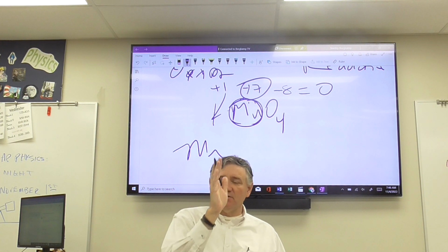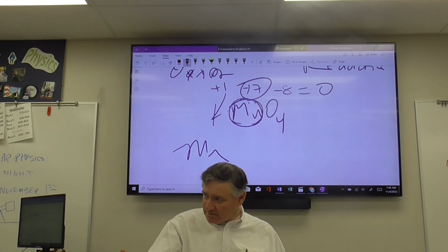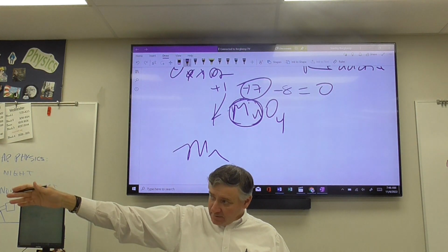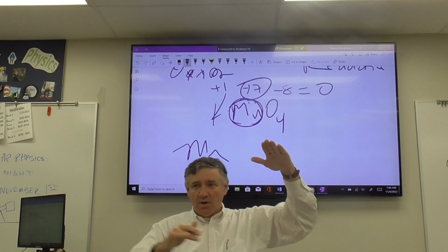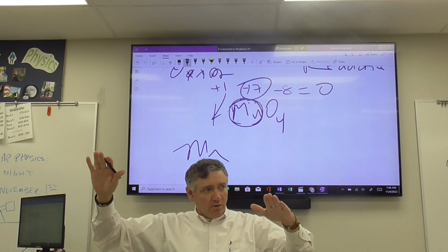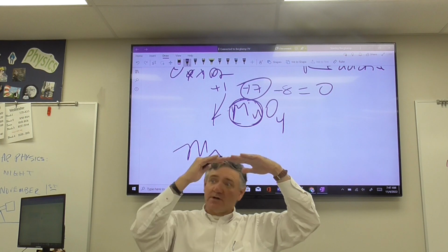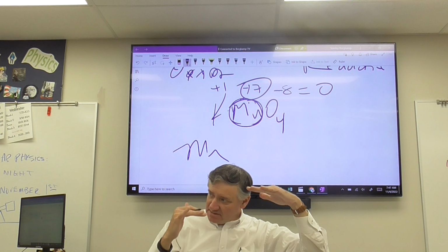What we're going to try and do is let manganese gain electrons in stages, okay? We don't want it to go all the way from 7+ to 2+ all in one step. It's like a pendulum. We're over here at 7+. We want to end up over here at 2+, but we don't want it to go all at once. Instead of one continuous swing, we want it to go in steps. We want to go from 7+ to 5+ to 4+, okay? And each one has a unique color.